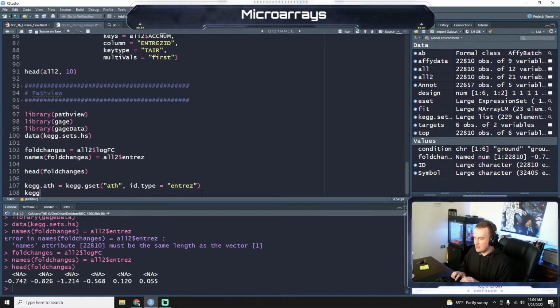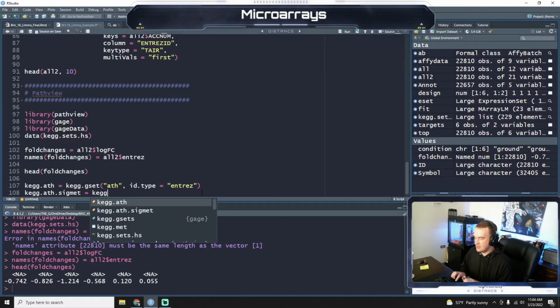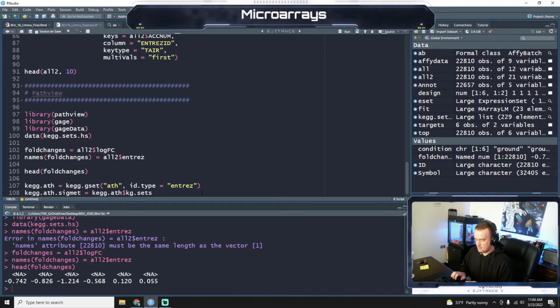Let's do kegg.ath.sigmet, kegg.ath kg.sets, kegg.ath sigmet.idx.